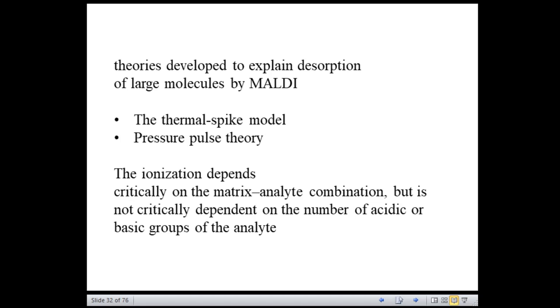The thermal spike model proposes that the matrix molecules sublime from the surface as a result of local heating at low laser fluence, but above a certain laser intensity.